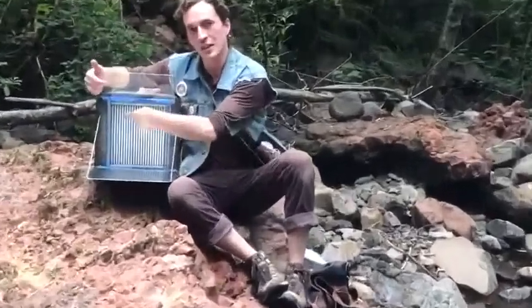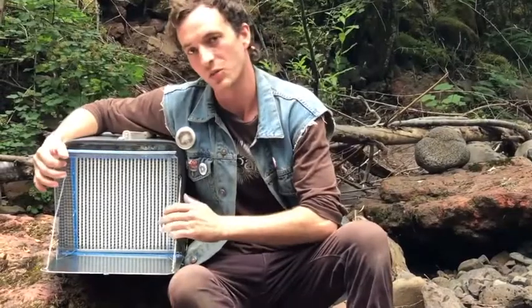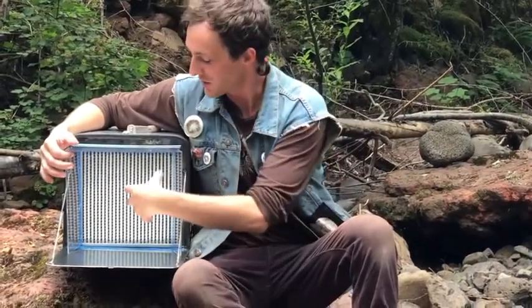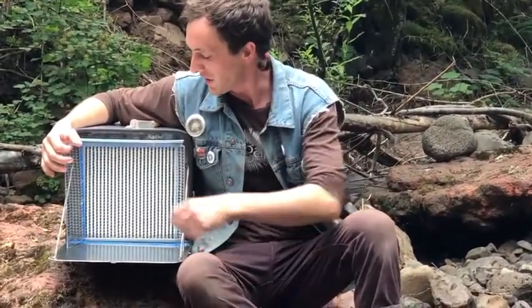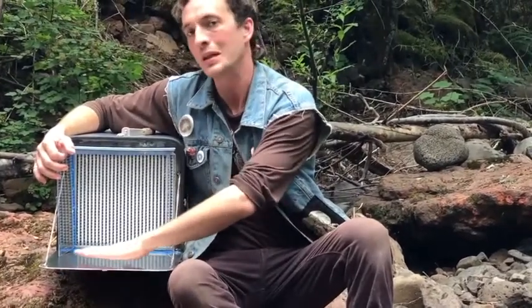A laminar flow hood is a really useful, important piece of equipment in all kinds of microbiology. It's essentially just a really nice air filter. It filters the incoming air so that the space in front of this air filter is almost completely sterile — nothing biological can get through.